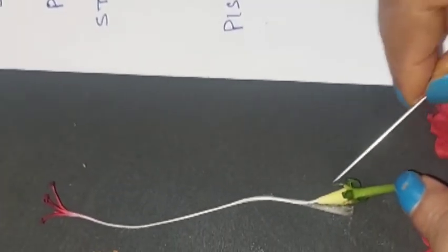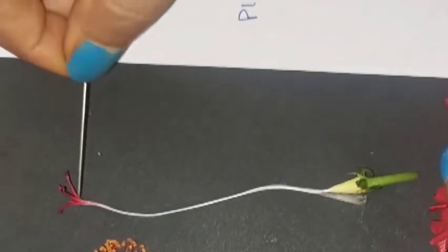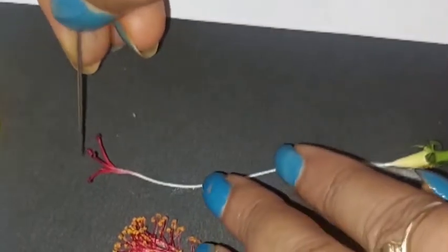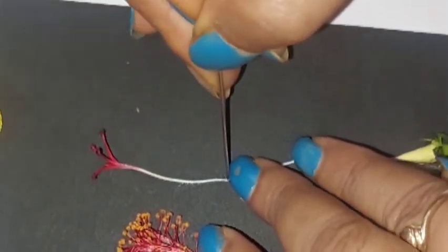This is the female part of the flower. We call it pistil or carpel. This is the receptor of pollen grains. Pollen grains germinate when they fall on the stigma of a flower of the same species.